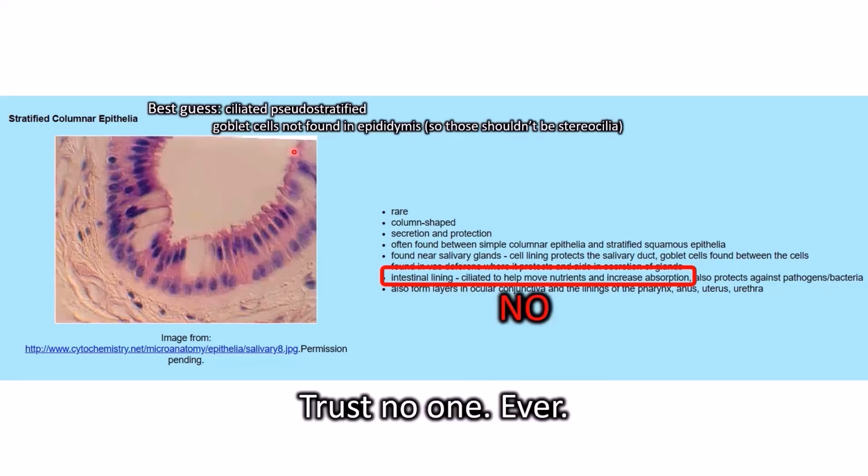Now that being said, this is a weird slide, and I fully admit there are things that I don't know about, so, just for curiosity's sake, I found the original professor that posted this. Even though this website is no longer functioning, they made a different one, and their contact information was on the page, so I emailed them and I said, please explain what we're looking at here. And I'm half expecting that professor's retired. But if I do get a reply, I will pin it in the comments.